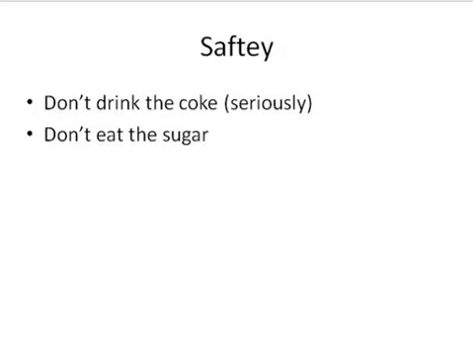It sounds a little silly, but it makes sense when you think about the fact that we were dealing with potentially poisonous substances last week, and we were holding them in the same glassware that we're putting the Coke in this week. So if you didn't want to put lead nitrate in your mouth last week, you probably don't want to put the Coke in your mouth this week, because it probably will contain some amount of the lead nitrate that you were working with last week.